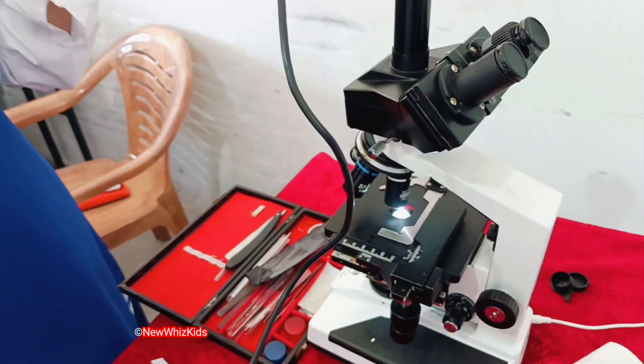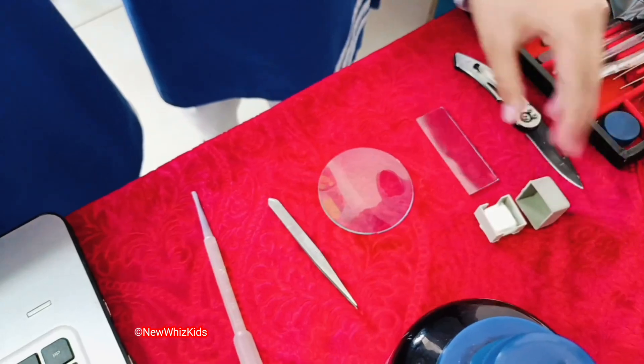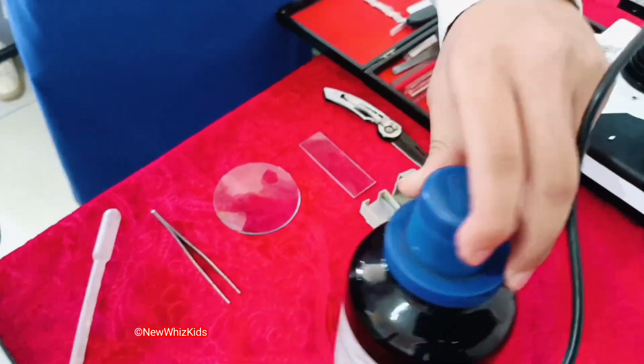The materials we require are: a compound microscope, a knife, a slide, a cover slip, a watch glass, forceps, a dropper, and a solution of iodine.